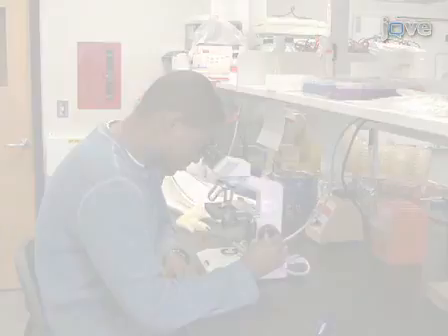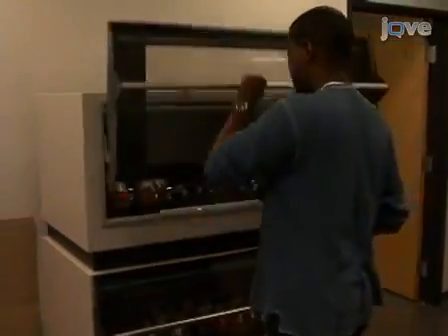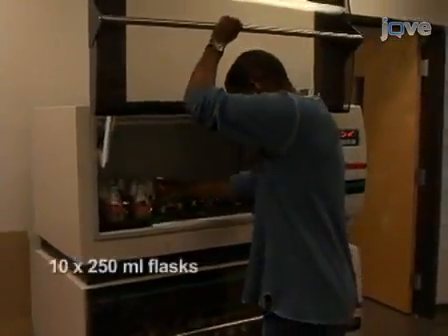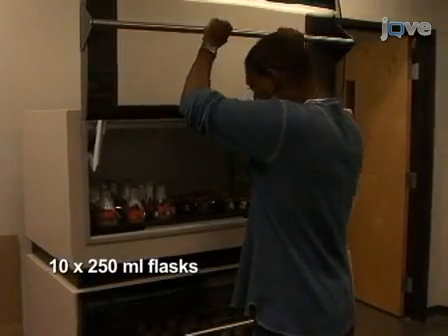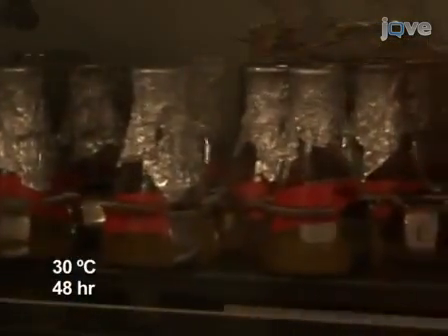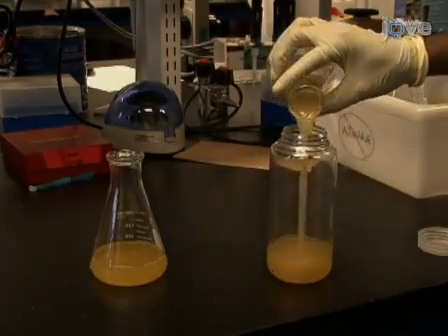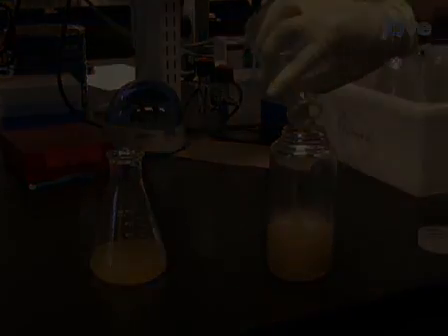So, let's get started. Begin this protocol by growing the yeast strain in 10 250-milliliter flasks, each containing 50 milliliters of YP medium at 30 degrees Celsius with rotational shaking for 48 hours. Next, pour the culture into 500-milliliter Nalgene.